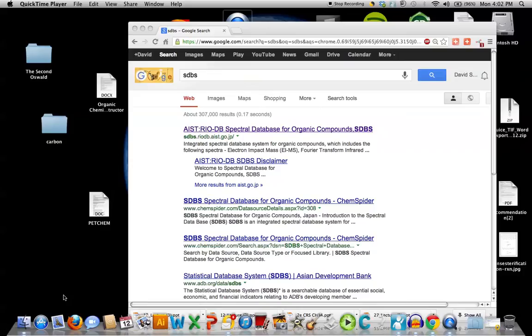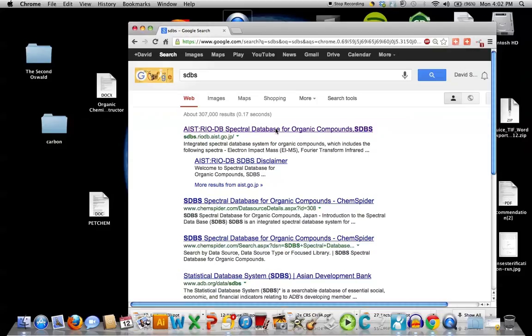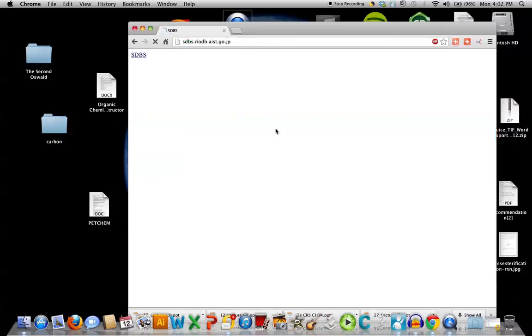Well, in any event, I'm using Google right now. If you type in SDBS with the Google browser, I'm using here Chrome, the first hit you'll see will be for the Spectral Database. And select that. Notice the extension will have JP for Japan. And when you left-click on that, you'll be brought to the database home page.